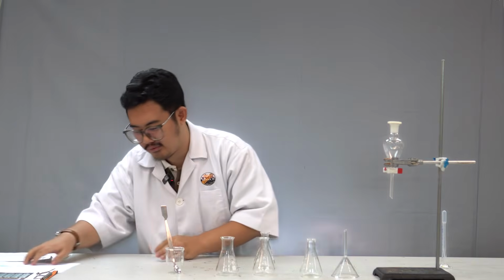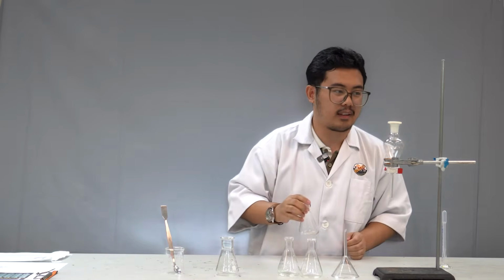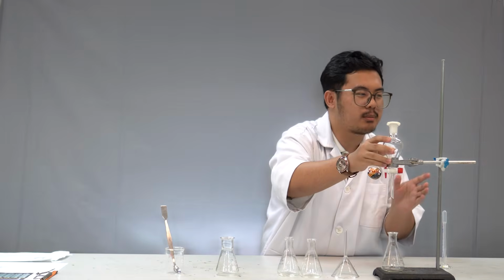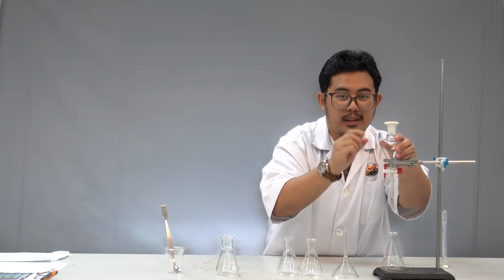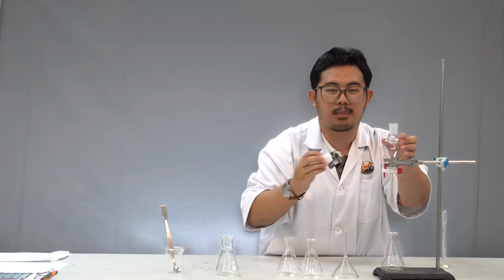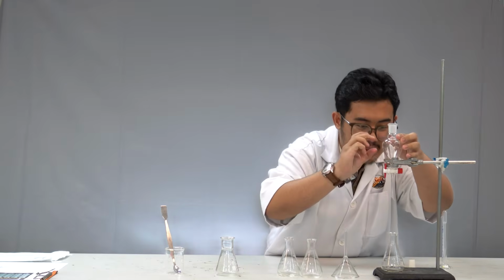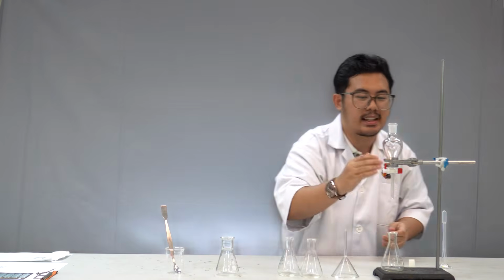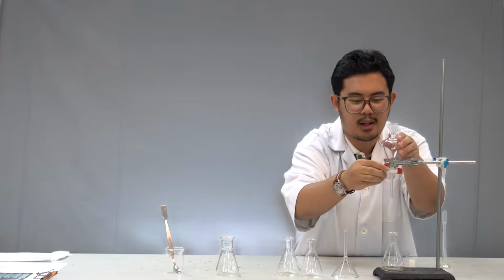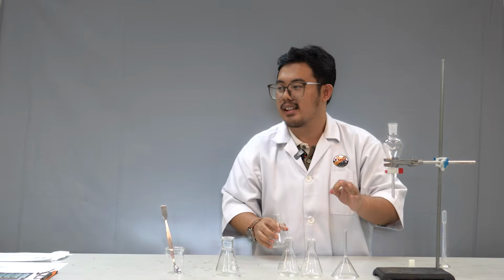So, the bottom is the mixture, so we take the mixture conical flask. We take the mixture conical flask, we pour it out. And again, some of you may forget, when you want to pour the mixture out from this separation funnel, you need to open the lid. So it actually pours out. If not, it does not pour out. So we pour it out until at meniscus level, you can see that the bottom layer is already fully poured out. And after it's poured out, we stop to make sure all that is left is the acid.